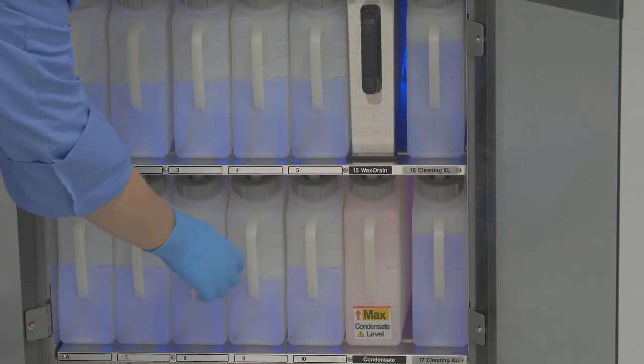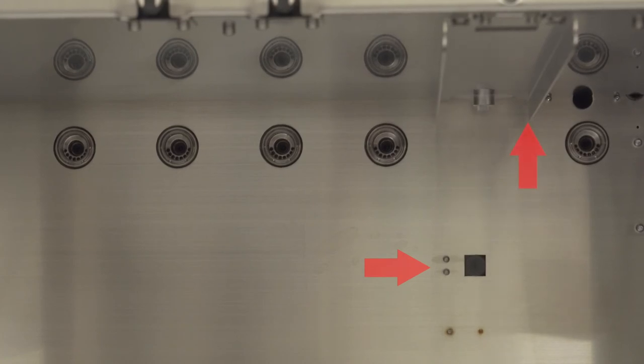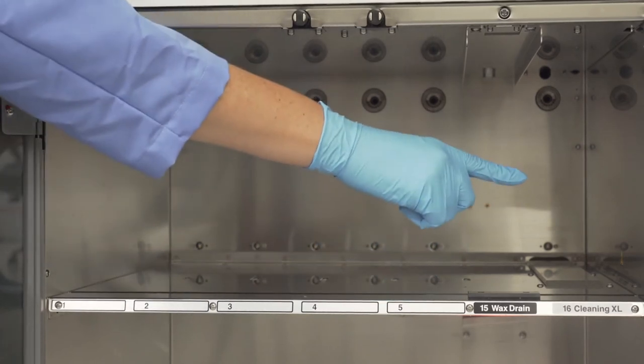On the back of the top shelf, you will notice a black square sensor and metal guide. The metal guide allows the waste wax drain container to be positioned correctly and the sensor informs the software that the container is in place.